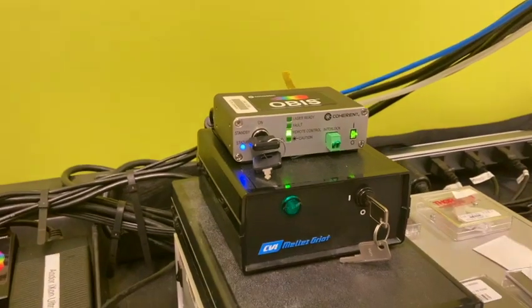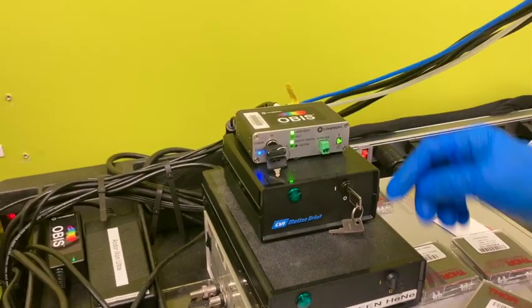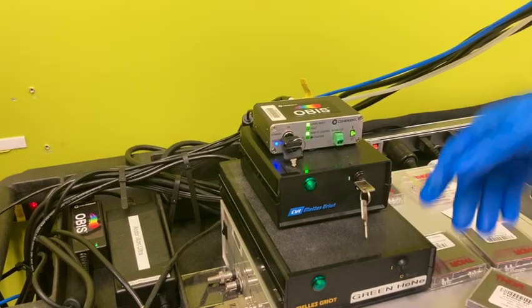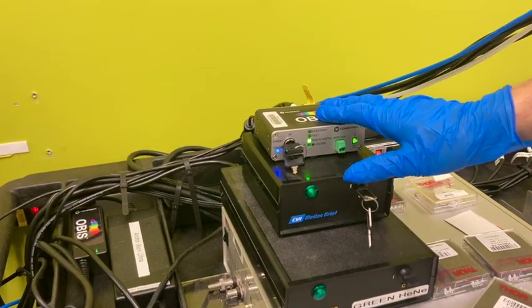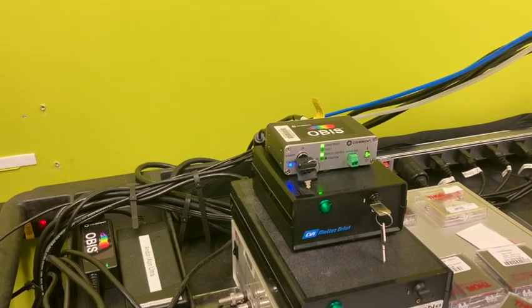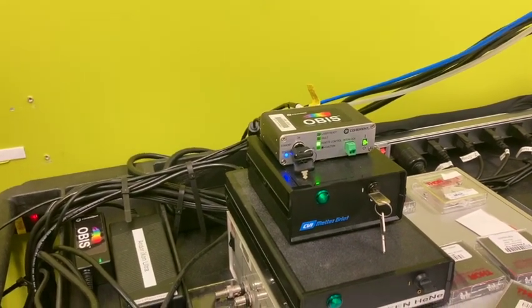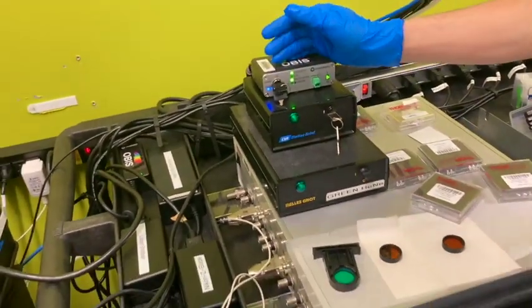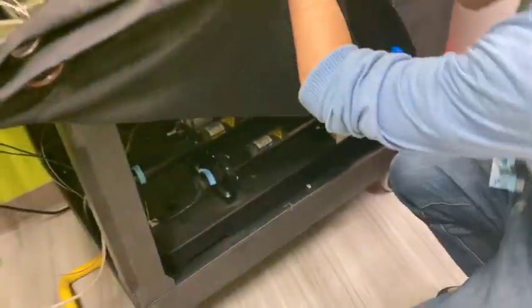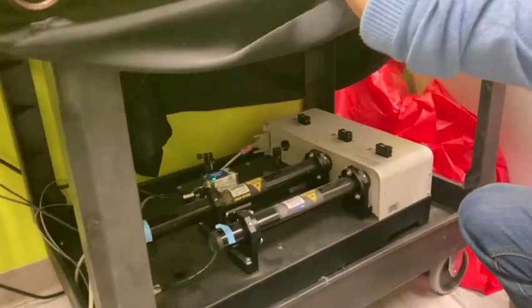That's kind of warming up for the blue laser. And the red and green, you can just turn on. Now we wait for these to warm up, and then we can switch to on, and then we have our illumination.